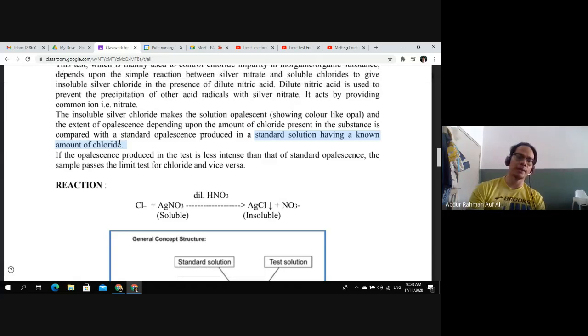Okay, so when you are doing analytical test, kamu akan nampak banyak perkataan standard solution, reference standard. So dia punya konsep is easy. A standard is bahan rujukan. Everything has a standard. Kalau kamu bayangkan orang yang cantik, what is the standard is up to you lah. Siapa kamu rasa orang yang cantik? Kamu rasa kalau kamu rasa mak kamu cantik, okay, that is your beauty standard. Okay, is up to you.